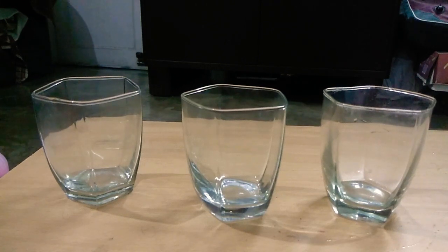Hello students, in this video I'll perform an experiment to show you the differences between three types of mixtures. First, let us understand what a mixture is.